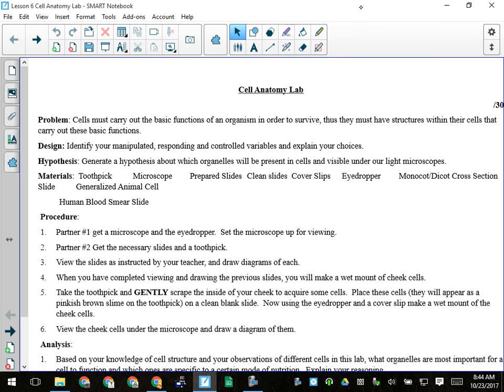All right. So your microscopy lab is due tomorrow. That was kind of the intro to using a microscope and being able to find stuff and make lab diagrams. This lab, now, I've got to be able to look at a cell and figure out what it is I'm looking at. And I hate to say use your imagination because that sounds bad, but you might need to use your imagination a little bit when you are looking at a cell and going, I wonder what that is. Don't wonder. If you think it's something, that's probably what it is.